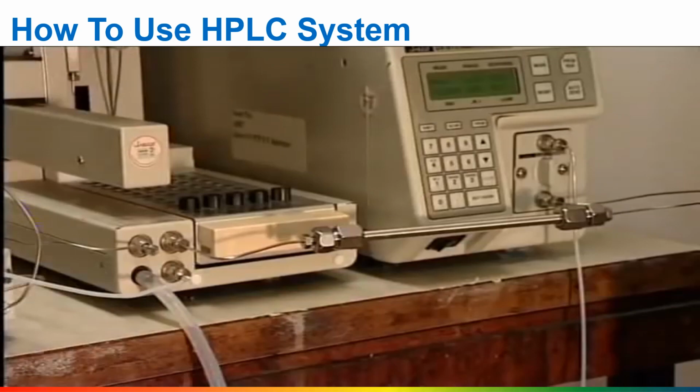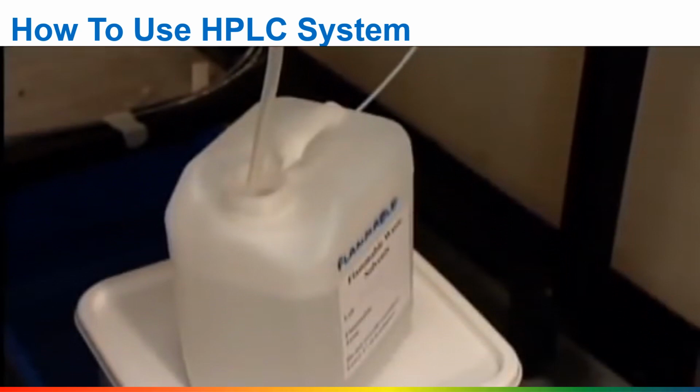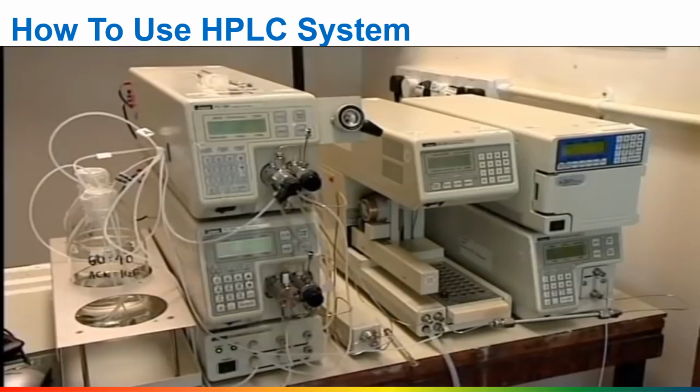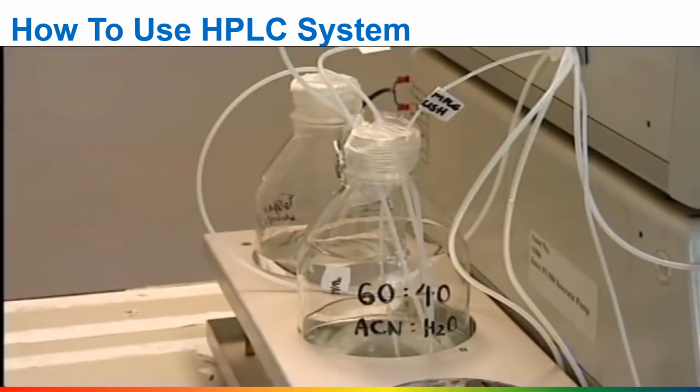In paper chromatography, the solvent moves along the paper by capillary action. In HPLC, the liquid is forced through the column by high pressure pumps. The whole apparatus looks like this. These bottles contain solvents. Two solvents can be mixed in any proportions to give a mixture, the liquid phase, of suitable polarity for the separation that is being done.